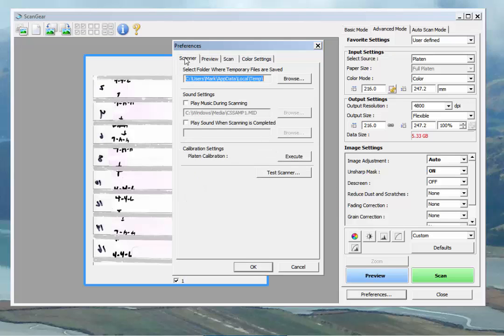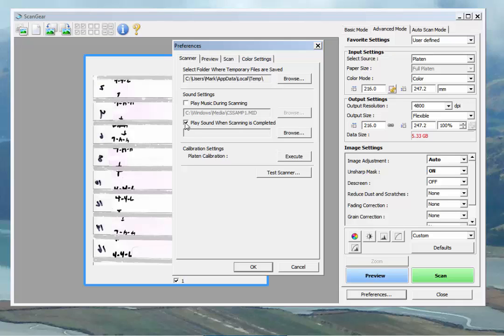And then over to the scanner overall. You can set where your temporary files are saved. Most people don't care about that. It'll play a little music. And if you want to multitask and do something else while it's scanning, you can have it set off an alarm when you get done.